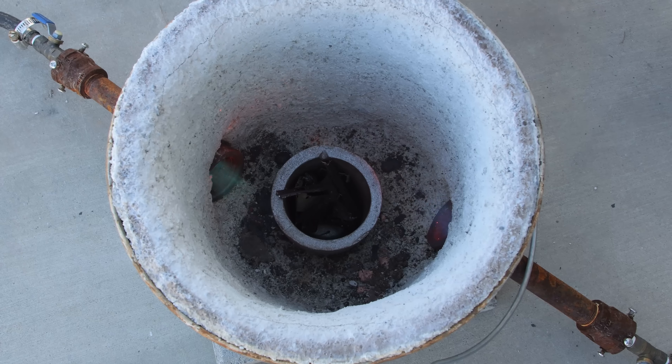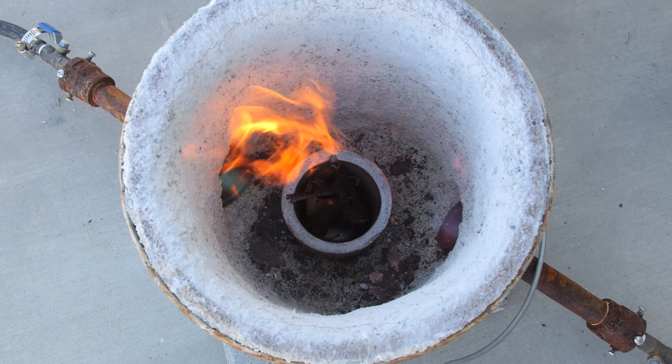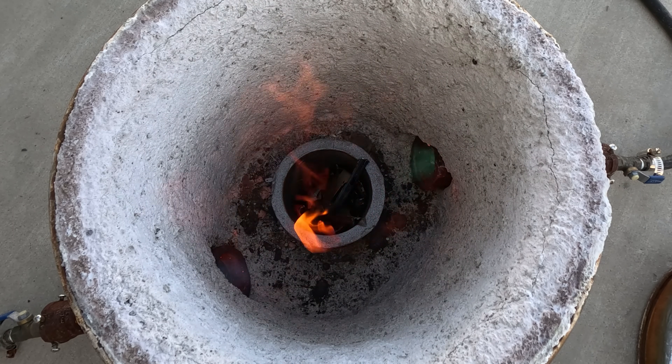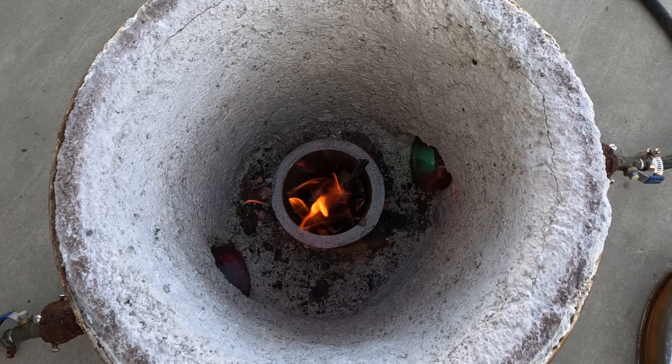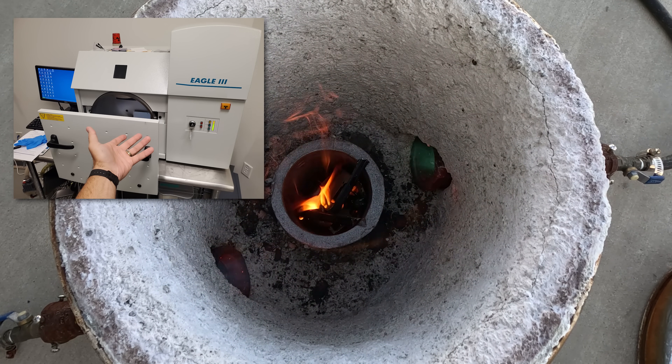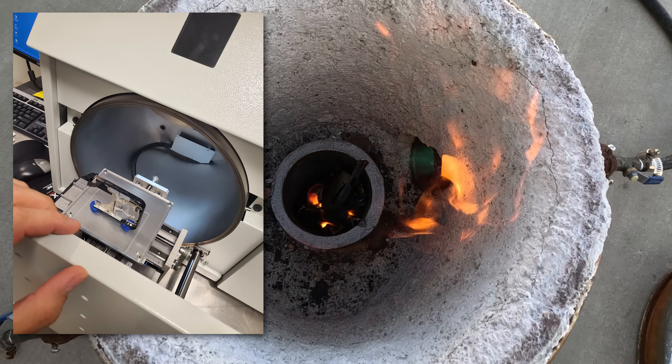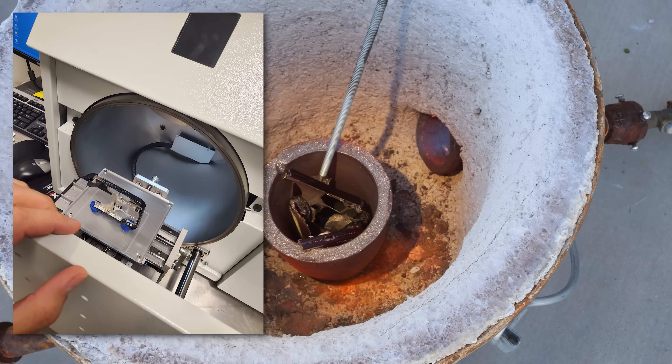Saying fire is the only way to analyze a material is kind of a stretch, since there are multiple scientific ways to analyze alloys without destructive testing — one of which is with a desktop XRF machine. Since we have a few minutes while this furnace gets up to 2000 degrees, we can go over the results of my scans.